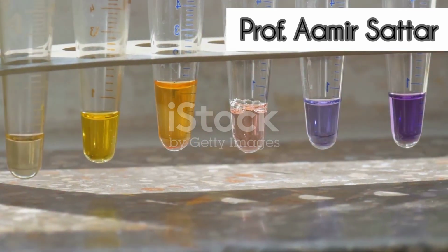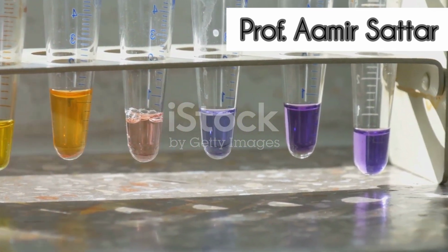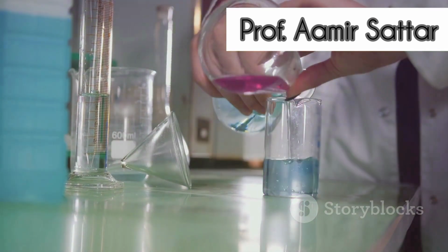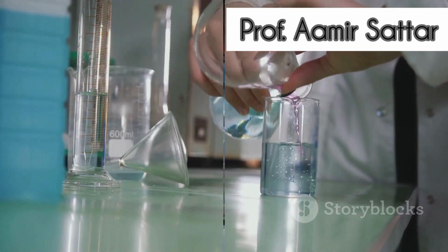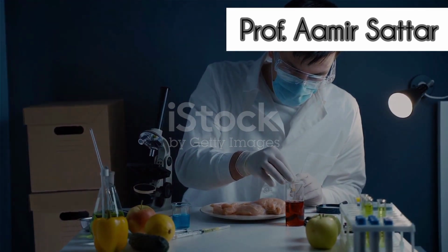Another method is the ninhydrin test, where a pyridine solution of ninhydrin is added to the sample. The formation of a violet color solution is a positive indication of the presence of proteins. Lastly, let's talk about fats, which are crucial for storing energy.